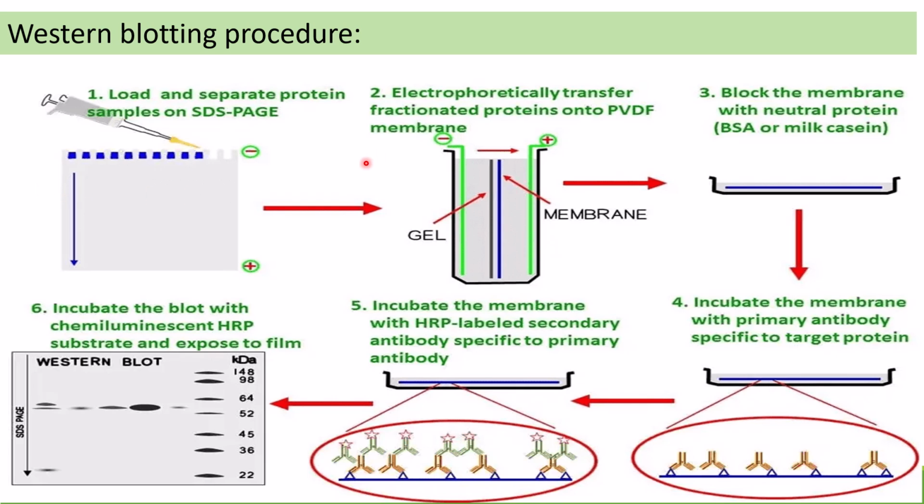Another step is transfer. Electrophoretically transfer the fractionated proteins onto a PVDF membrane. Now we have separated the proteins here. After separating proteins, what will happen?